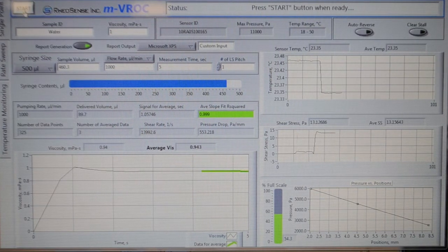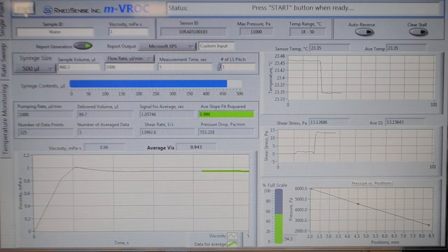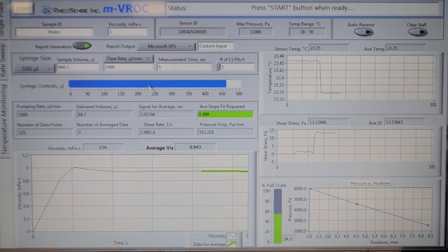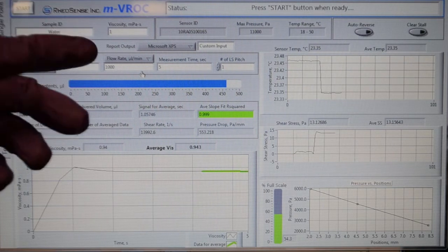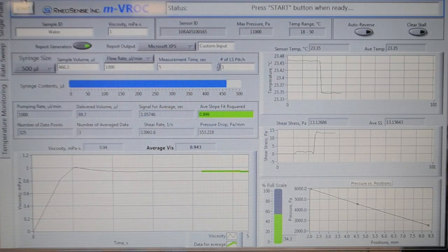Since our flow rate and measurement time are the same, you can go ahead and click Start.